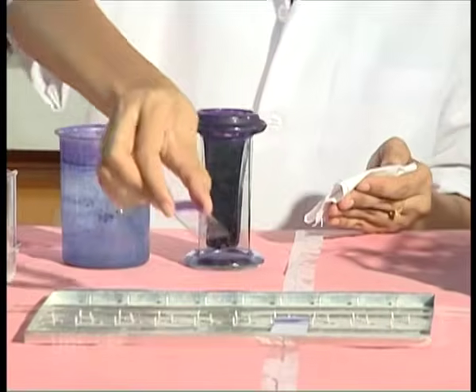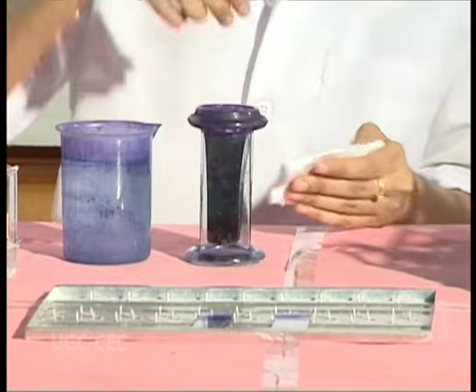Let the slides dry before observing under the microscope.